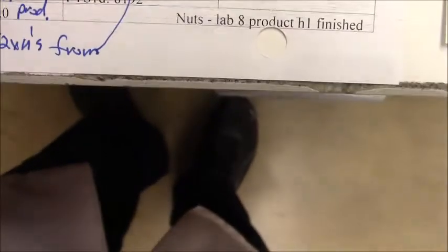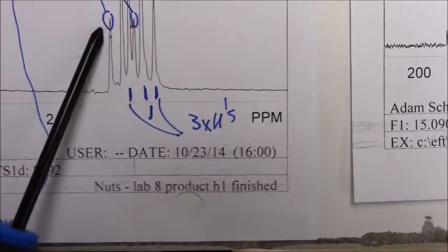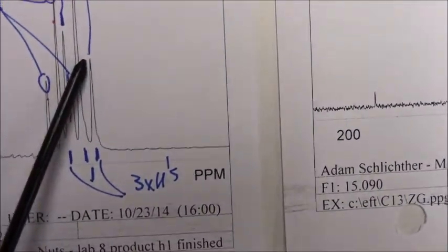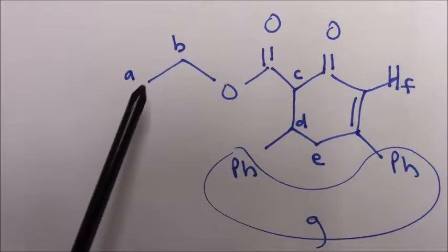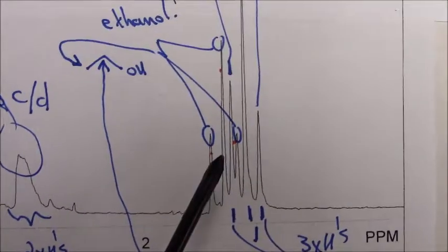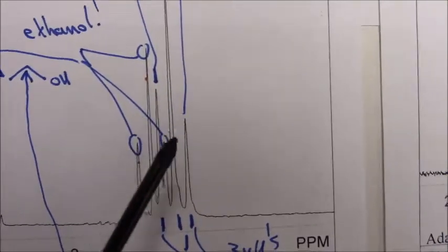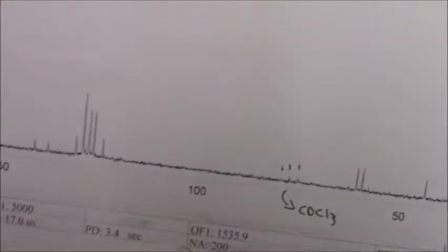So you could see the methyl group triplet was overlapping with the triplet. So A of our compound gives a nice triplet, and it's down here at 1.0 something-ish, right? So I've labeled that one as A, but just watch out for that. So that's the proton.